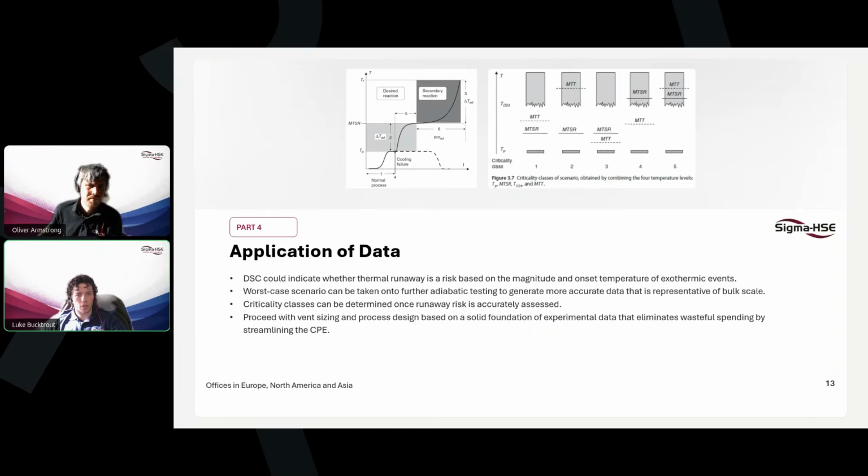So we covered a lot there on how useful and versatile the DSC is. You talked about calculating adiabatic temperature rise of your desired reaction. So why would we need any other testing for conducting a chemical process evaluation, Ollie?